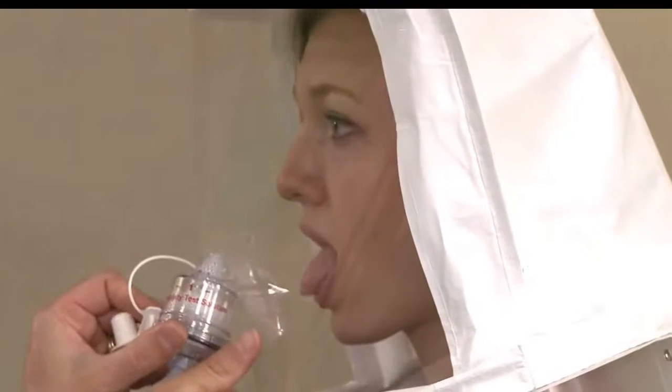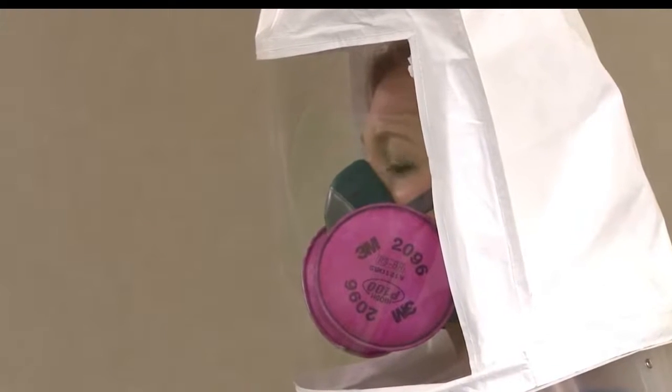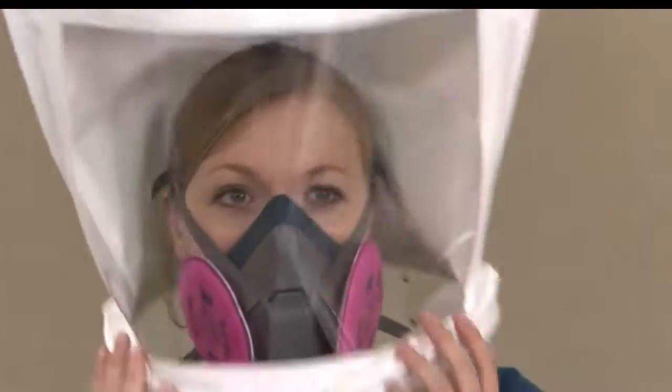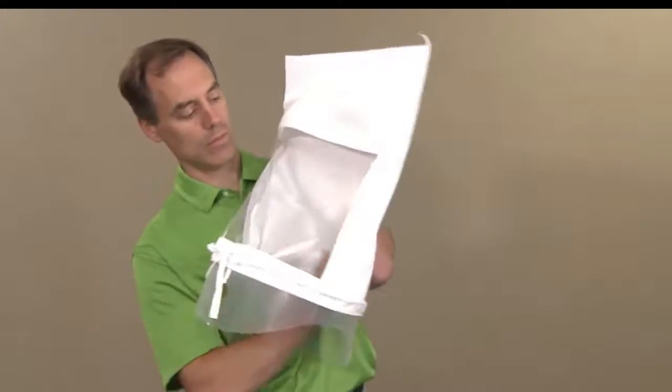Once you clear the taste of the test agent from your mouth, you'll repeat the sensitivity test and fit test procedure. If you complete the exercises without tasting the test agent, the respirator fits you properly. You passed the fit test. After the fit test is complete, the hood will be cleaned with a disposable wipe.